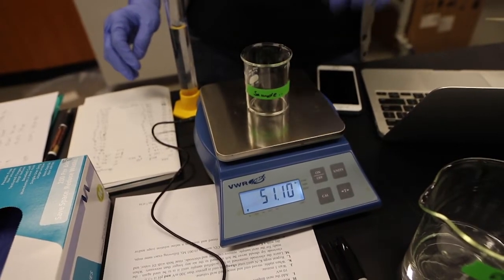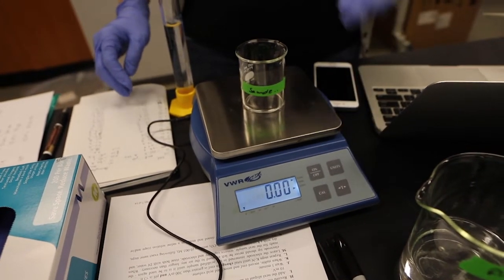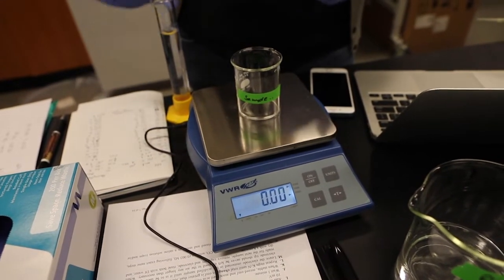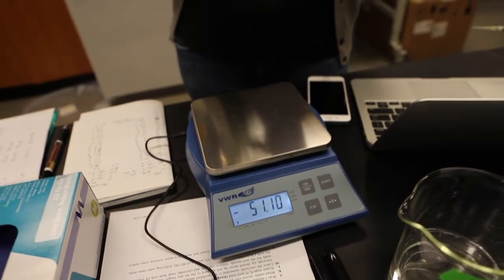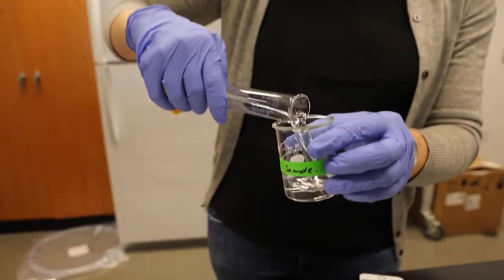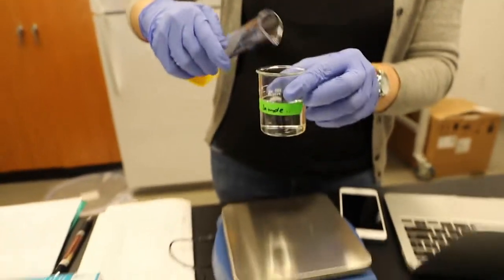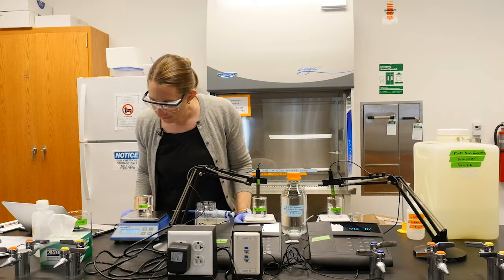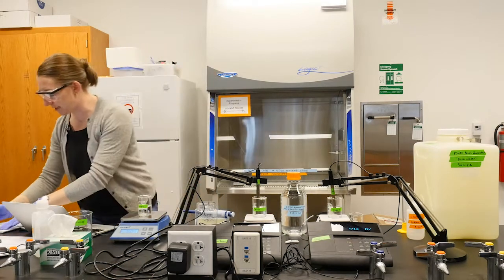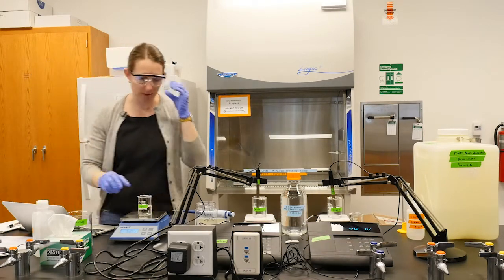We're going to put our beaker on here, and we're going to tare the scale to set it at 0. And then use the mass that we add here as our accurate measure for the volume. So we've got our beaker. I'm going to pick that up to pour our 50 milliliters of seawater sample in and measure the volume there. So 50.55 grams is the mass for our seawater sample.